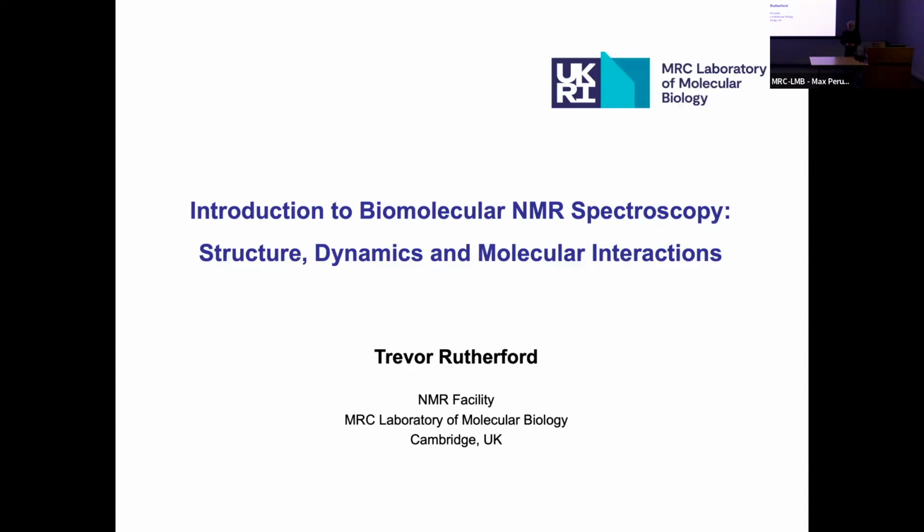This is the first of two lectures that we're going to have in the Biophysical Techniques lecture series on introducing the wonderful world of NMR spectroscopy. What I'm going to do is look at the basic principles of NMR, where the NMR signal comes from, what properties of a molecule affect an NMR spectrum, and then we can work backwards from measuring an NMR spectrum. We can infer behavior of molecules in solution. And I'll look at the general scope of what's achievable within the biomolecular context.